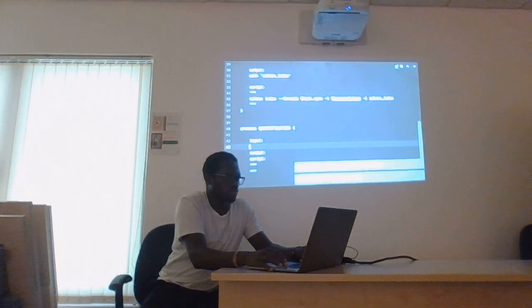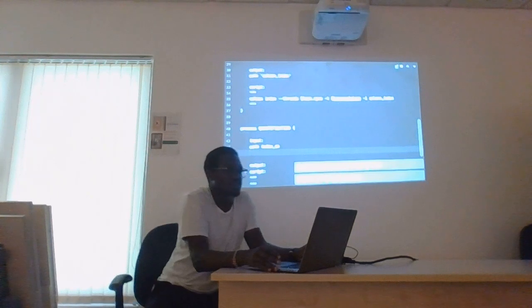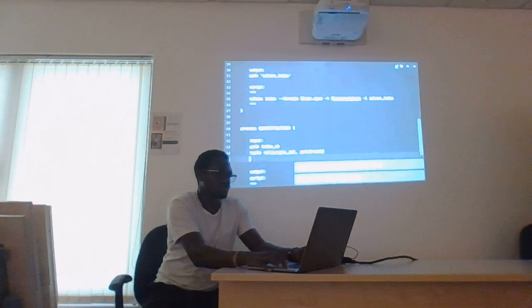So our input here is going to be the path to which channel. The first input is the index, so this should point to that. Then the second input is a special type of channel. It's going to be given as a tuple, having the value of the sample as an ID and the path as a path to the reads. Okay.